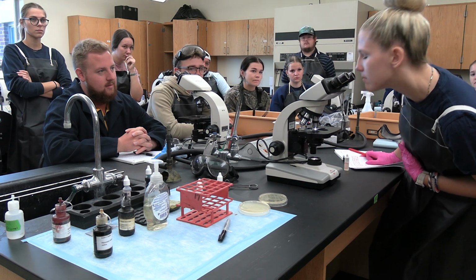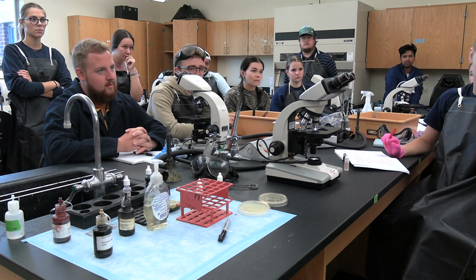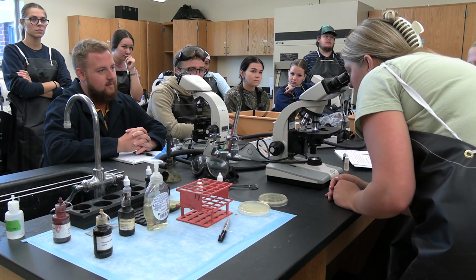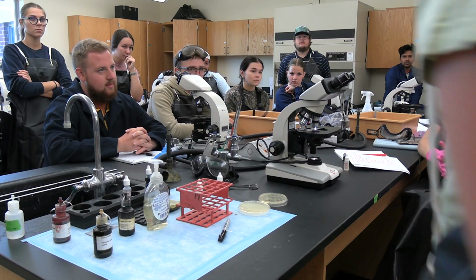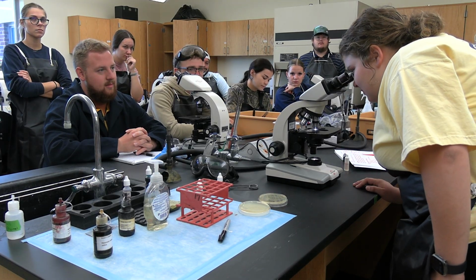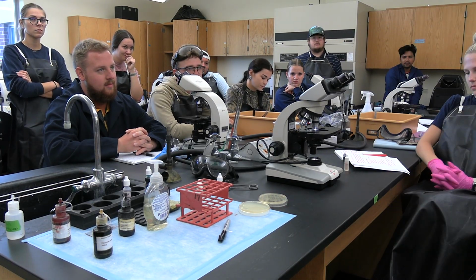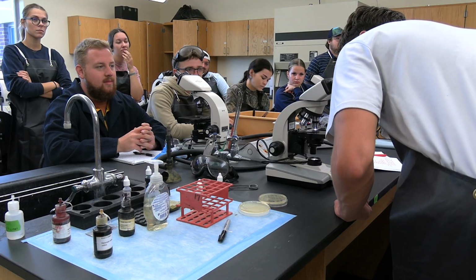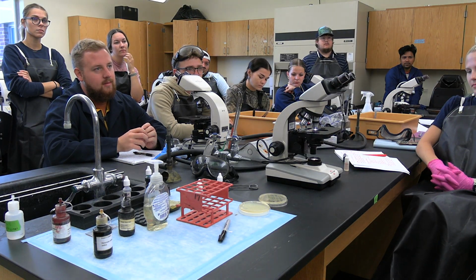That's 100x, gram positive, purple color. Go ahead and see it. Gram positive, purple, and it's a chain, cocci, it's a chain. Come here to see it again. I'll have another one. Hopefully it works. Okay, so you can take a picture, which is a very good gram positive cell.